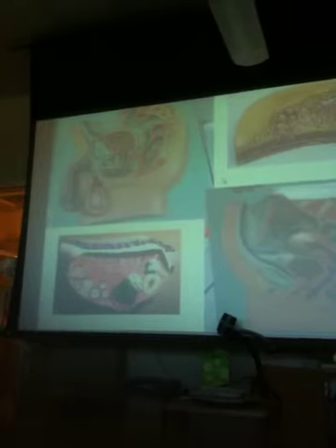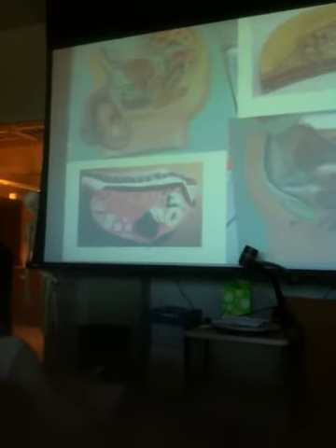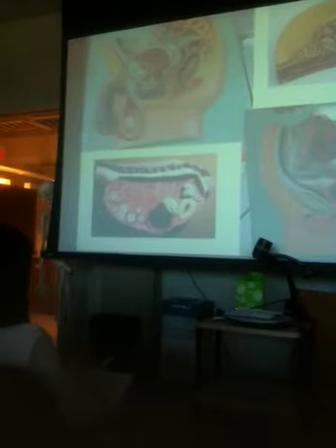Okay, so here's male. Remember I said when we started on the reproductive system, most people have an easy time with the anatomy. The physiology is tougher, so you just answered that question of mine, made that point. Okay, so let's see. We're looking at an ovary actually right here, and here is ovulation. There is that stage that I was just pointing to, except it was inside of the Graafian follicle. This is the follicle right here.